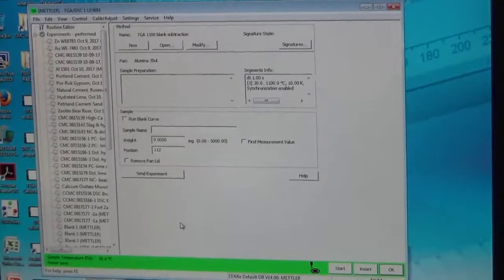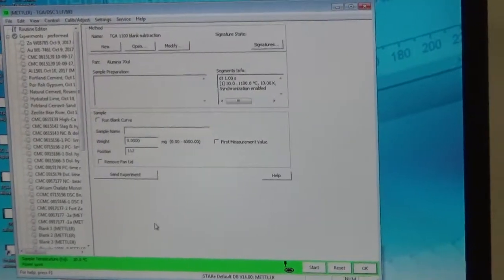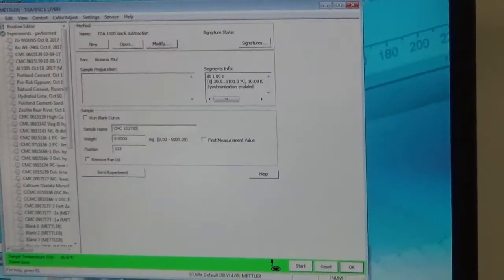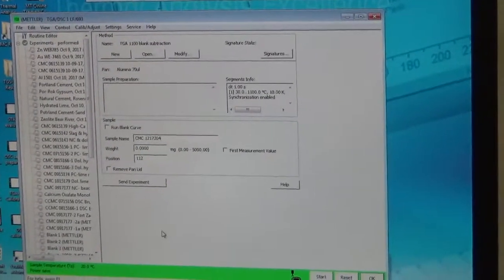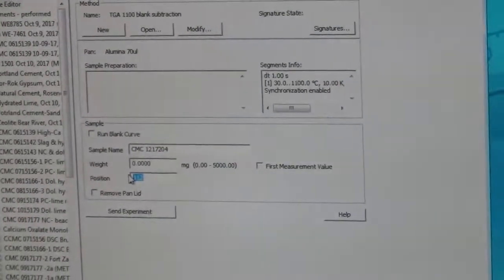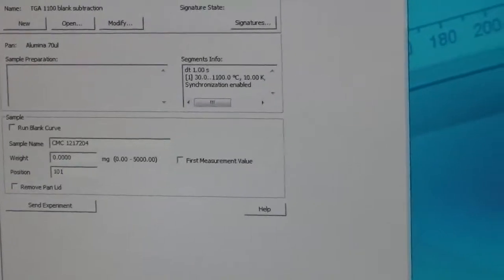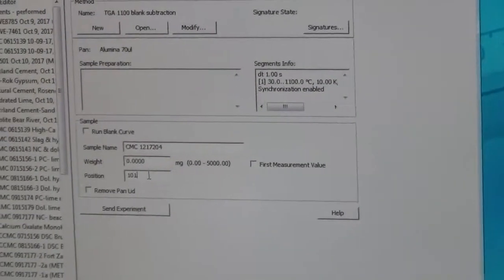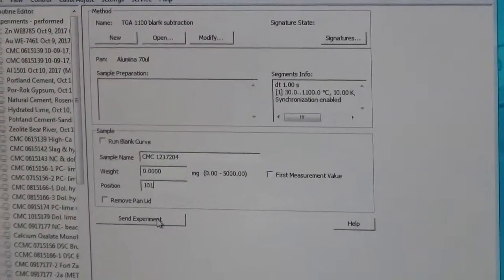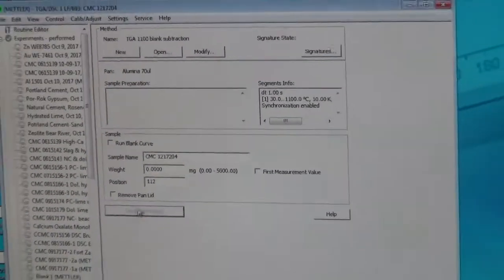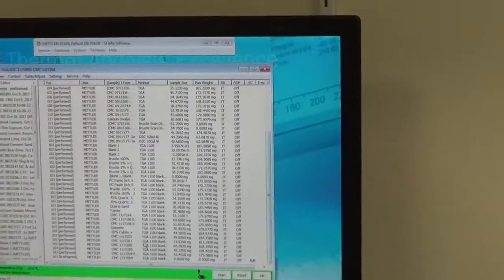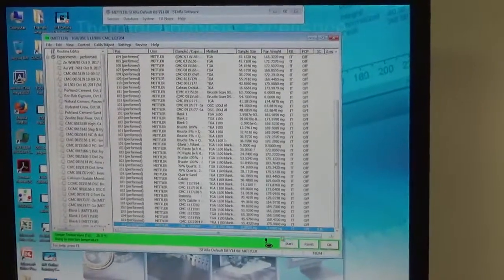We have to give a sample name. We give our CMC project number. After we insert the CMC project, we don't insert the weight because the balance will determine the weight. We give the position 1, 101, where the empty crucible is sitting. Then we say 'send experiment.' Once we say send experiment, it shows up under the experiment-performed screen where it says 'in progress.'